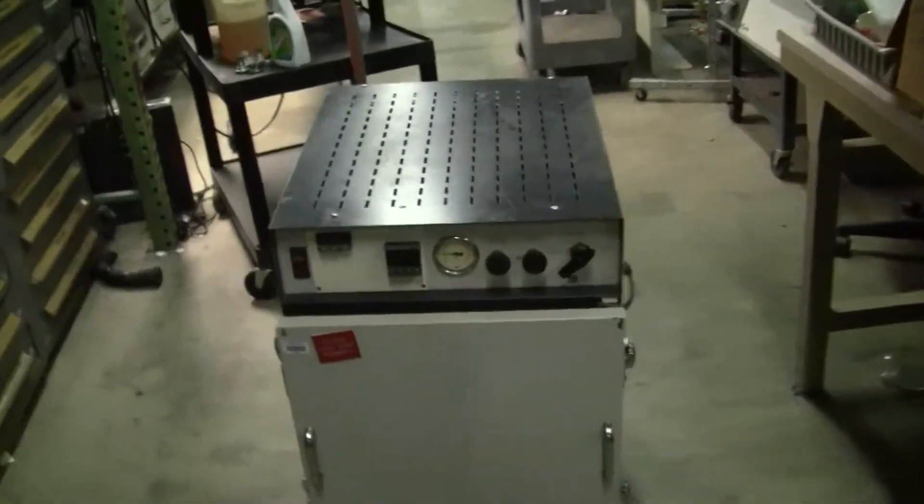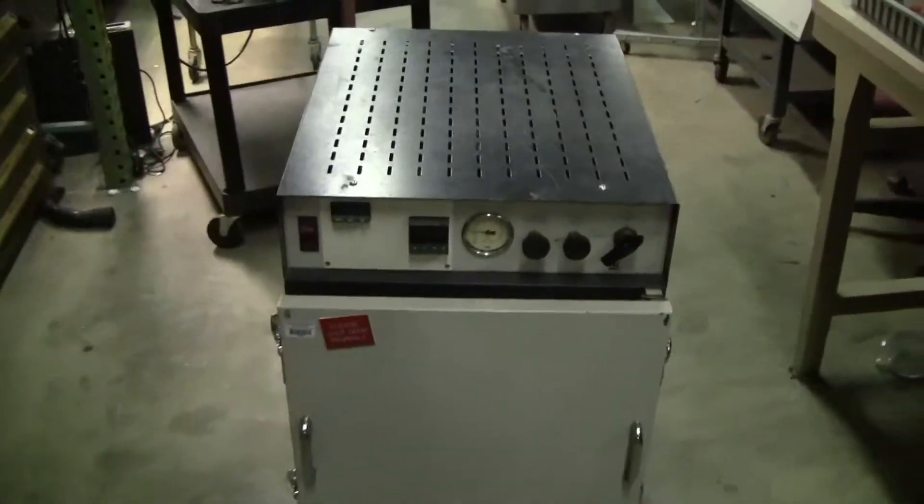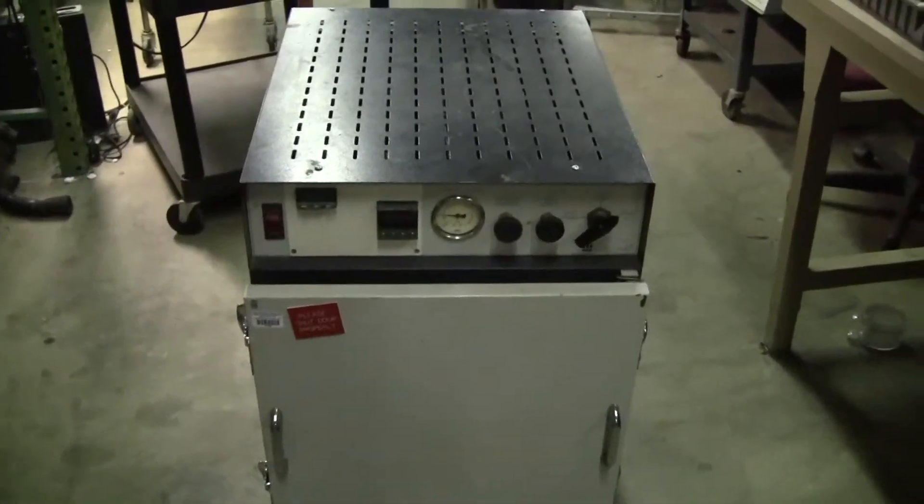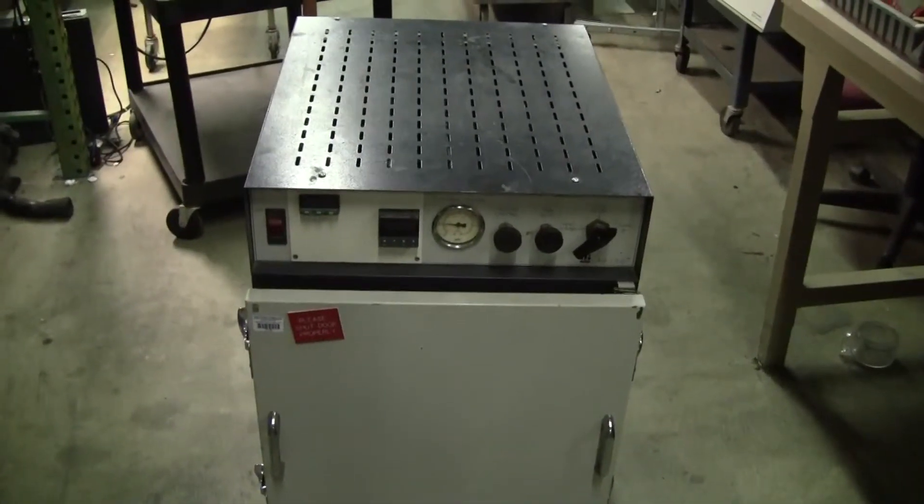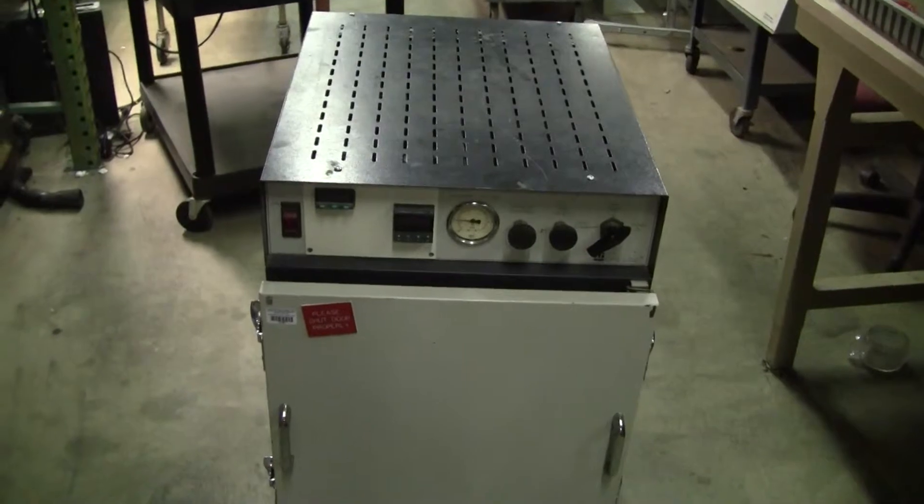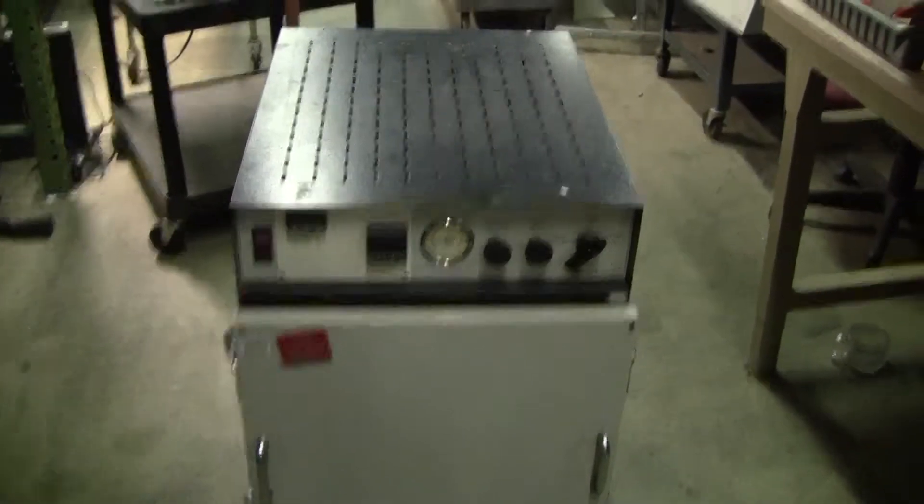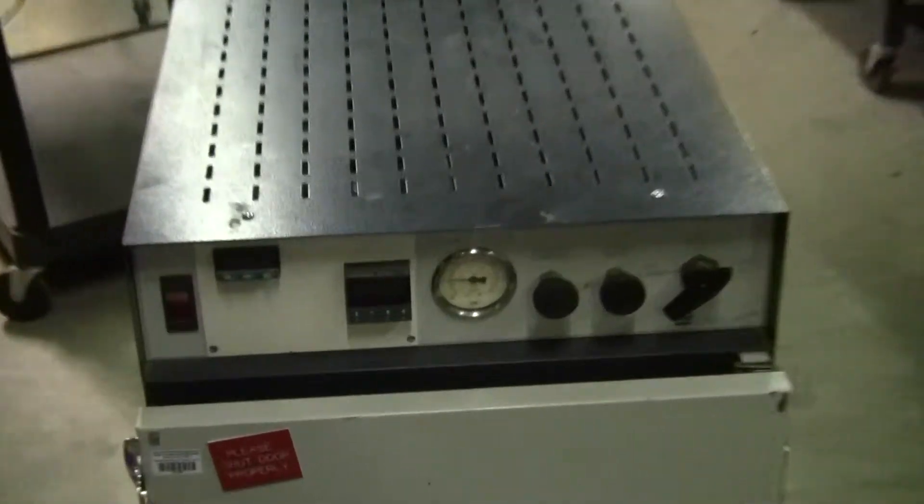Hi, this is Michael from HitechTrader. Today we're looking at a vacuum oven with an updated control panel.